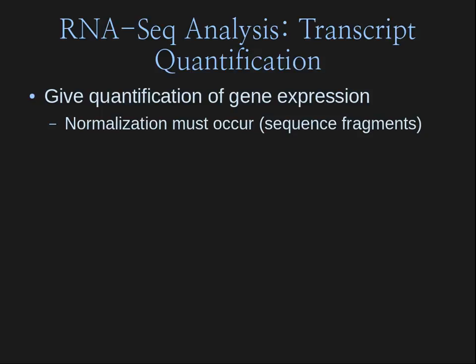One of the things that we really want to be able to do from RNA-Seq is to quantify gene expression. Now, this isn't the only thing that we want to do from RNA-Seq. This is the main thing I emphasize in lab, because that is one of the predominant things that people do with this. However, you can also do a lot of other things. Like, you can be looking for alternate splicing variants in genes. You could be looking for RNA editing. You could be looking for all sorts of modifications to mRNAs as well. There's so many things that you can be doing with RNA-Seq apart from just gene expression. But for sake of time, that's where I'm focusing right now.